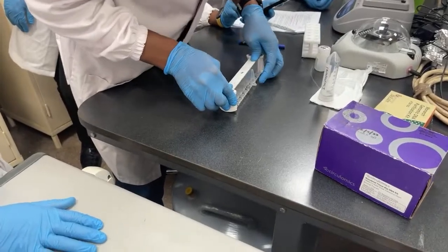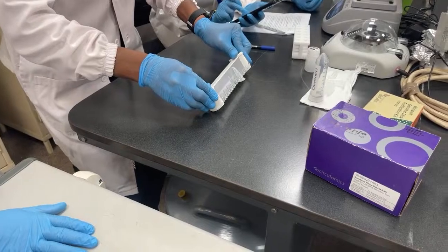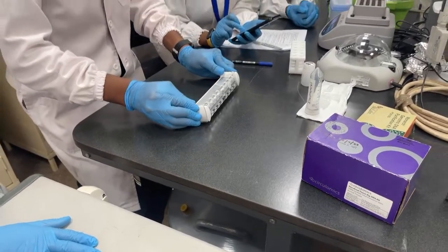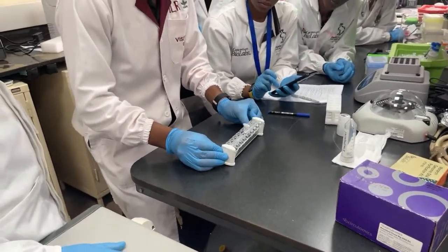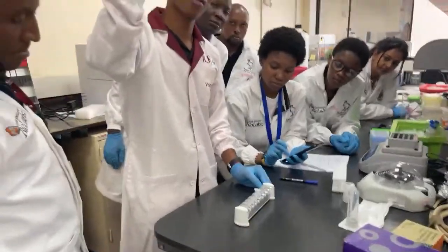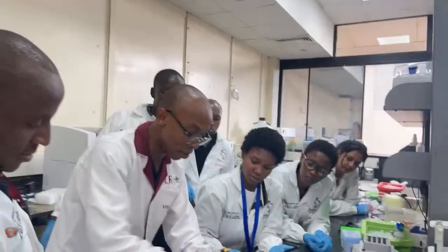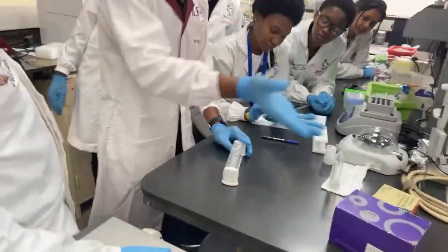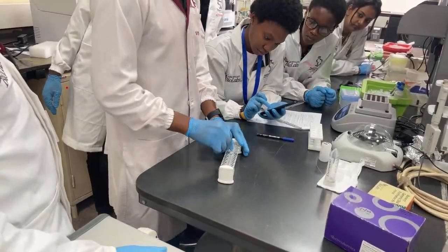The sample is at the top, it's going to be at the bottom, but you slowly tilt it back. So the idea here is to have the disc up there, so that when you open it, it's only the liquid here, and you can take it out, wash, take it out. That's what we're going to do with our samples.